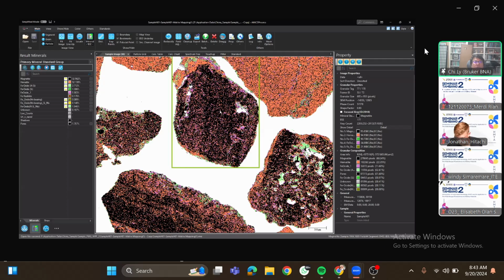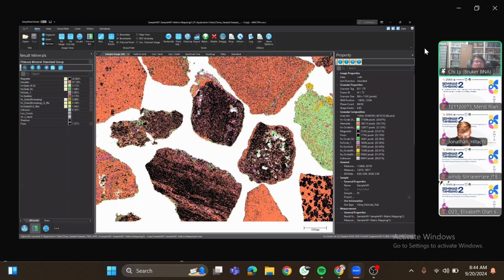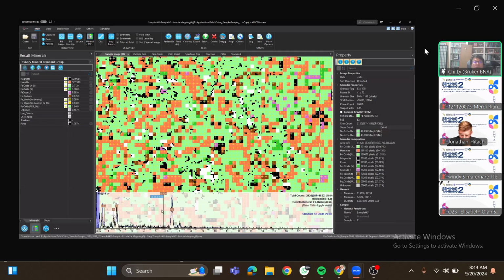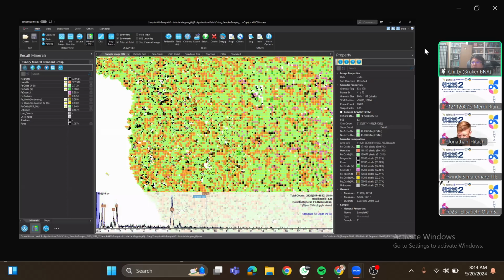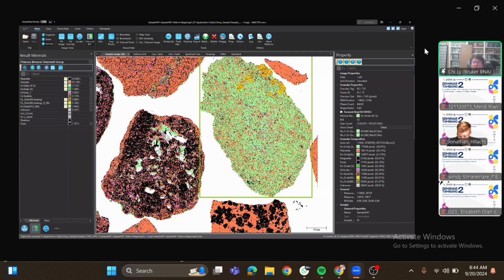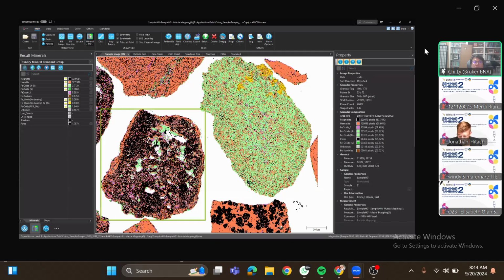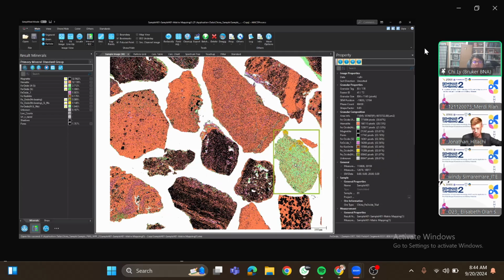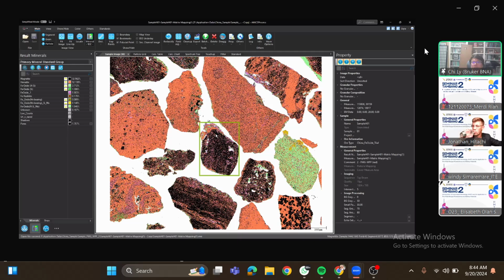In addition to, if we look at the goethite, we can see that the goethite is a little bit dirty. And so they do have deleterious elements scattered throughout the actual material. Again, that is critical information if you're receiving ore and that's going into your blast furnace. So apart from understanding the particle size of the material that you're getting, you'll also understand the actual composition of the different particle sizes. And so that might give you an ability to further upgrade the material by removing the goethite, treating it separately, or blending it and creating pellets.